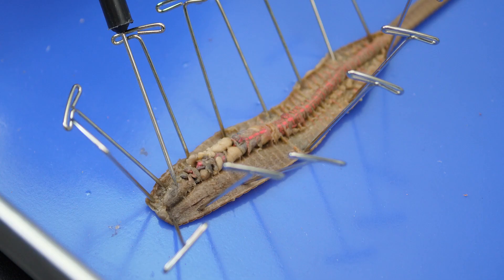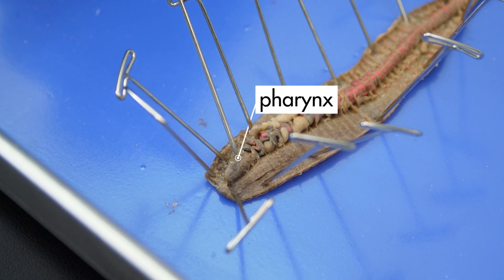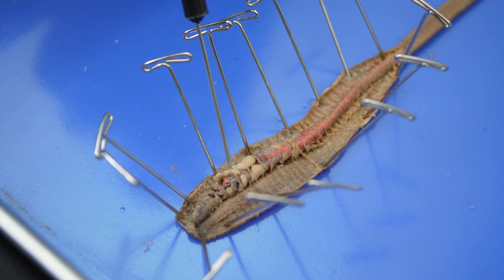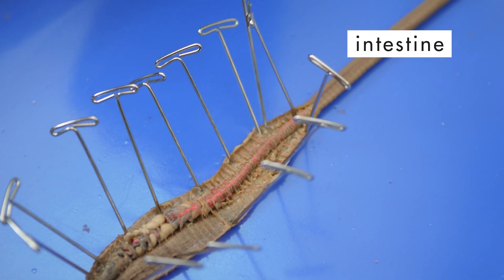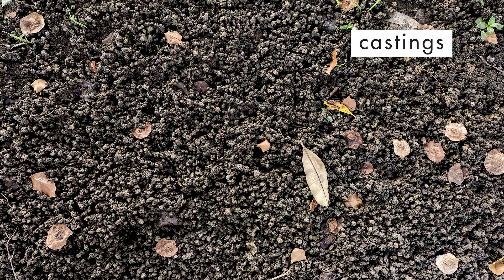With the coelom opened up, we can see the earthworm's digestive system. An earthworm feeds on dirt, which passes from the mouth into the pharynx. From the pharynx, food passes into the esophagus, but we cannot see the esophagus because it is hidden beneath other organs. After passing through the esophagus, food enters the crop, the gizzard, and the intestine, which extends the rest of the length of the worm. Solid waste, called castings, are expelled through the anus at the posterior end of the worm.